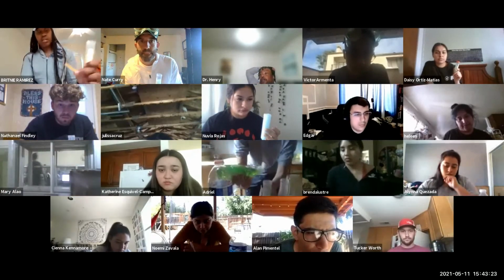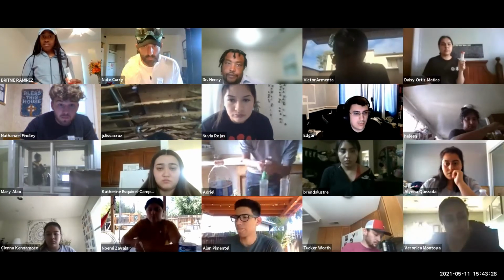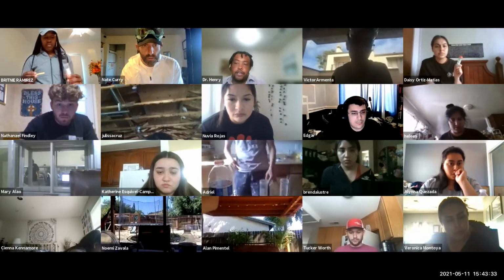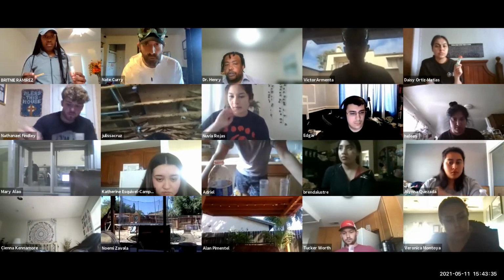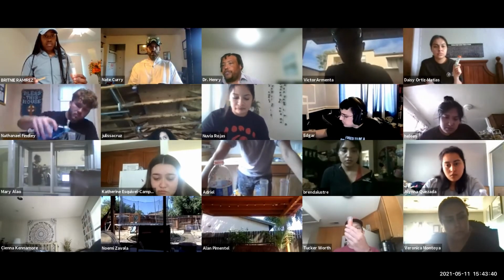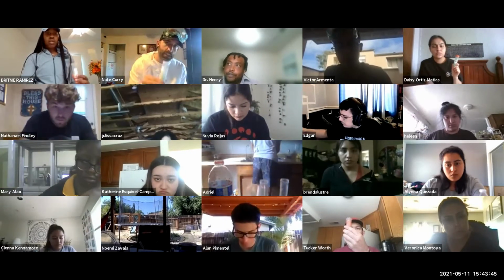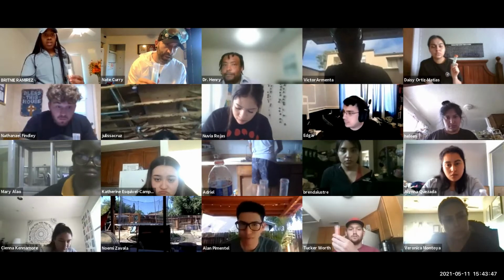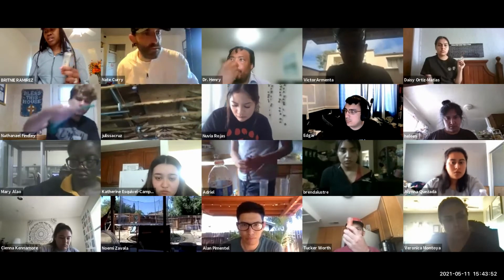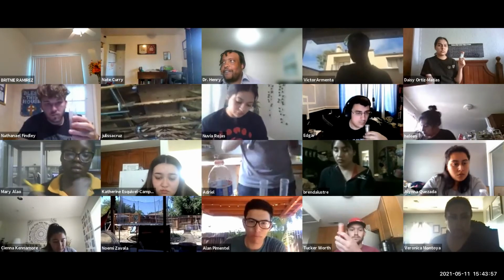Yep. Okay, and so what you need to do, you want to do confirmation of your experiment. You want to do it 3 times. Now that you've got your condition, you're using the initial solution, solution 1. You're going to do exactly the same experiment 3 times to make sure that your values are accurate. So pour it out, put in soap, 10 milliliters of solution, and then the baking soda, and then measure. So do this again? Yep, you're going to do it again. Do it 3 times. Why do you want to confirm? Hey, you're going to be good scientists. We're going to talk about error and stuff.